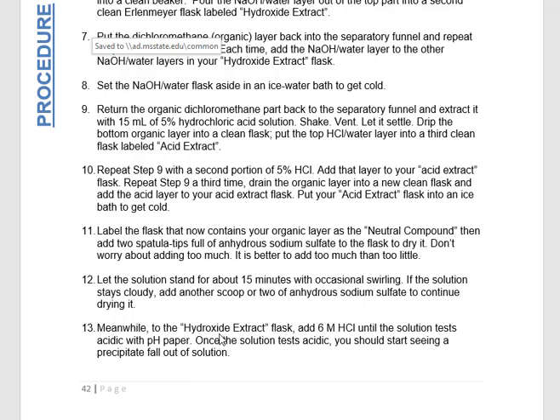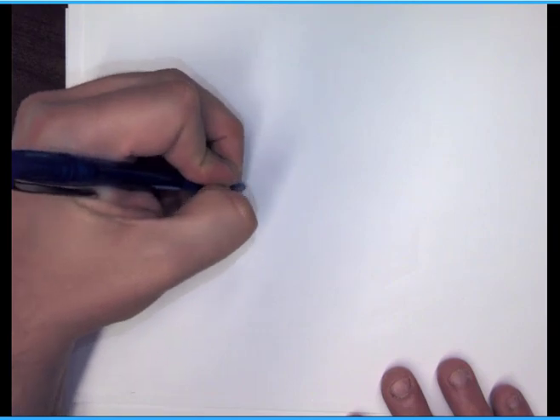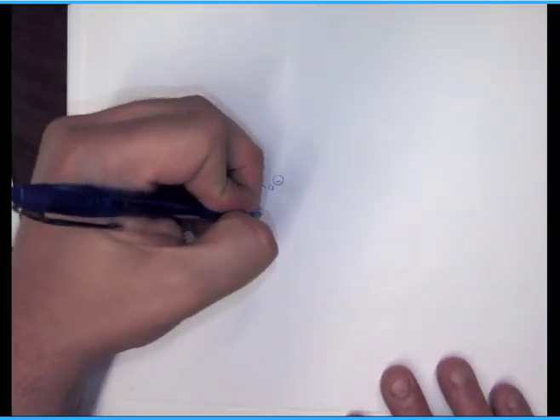So your carboxylic acid is negatively charged because it reacted with the base, hydroxide. In order to separate it out from solution, you're going to react it with a strong acid, HCl, so that you can neutralize it. So in order to remove it from solution, you're going to have your charged carboxylic acid. I'll put the Cl there, it doesn't really matter.